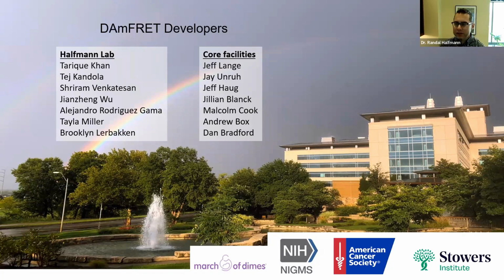I think you could enrich for it. In principle it could help you, but I think it would be very challenging. Let's take the example of the SUP35 number 24 mutant. There's a relatively well-defined population of cells that had some metastable species, so you could imagine enriching. You can definitely use FACS to enrich that population of cells. What you do with them after that becomes the challenge.